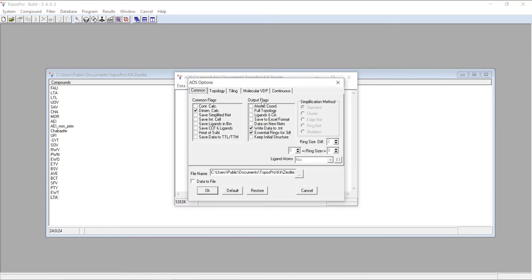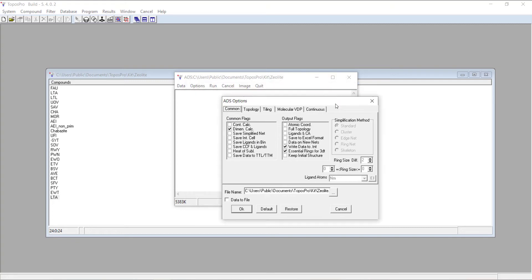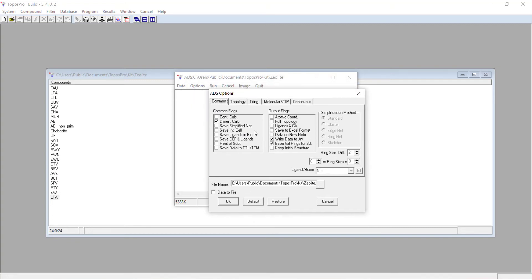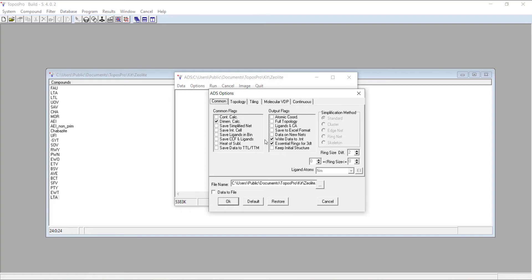The options this time are going to be quite different. The process for creating a structure file for a tile crystal is by calculating a tiling, not just simplifying the net. Instead of saying save simplified net, we're going to have dimen calc selected. If you also want to visualize the shapes of your tiles in 3DT, you want to make sure you have essential rings for 3DT selected here.